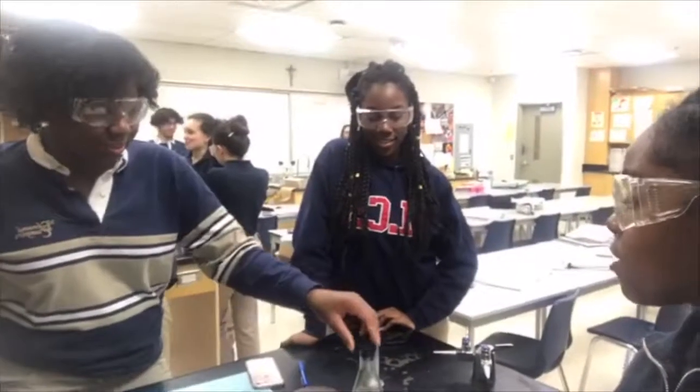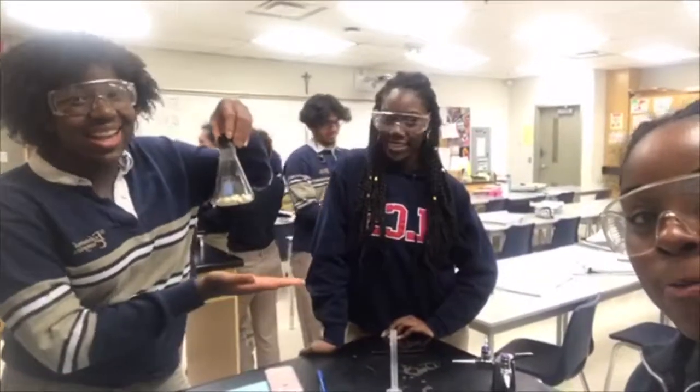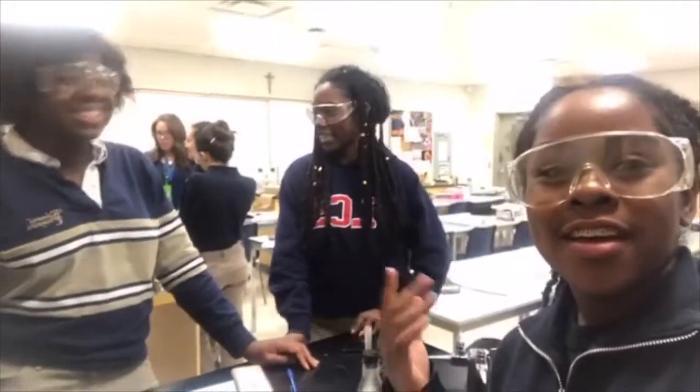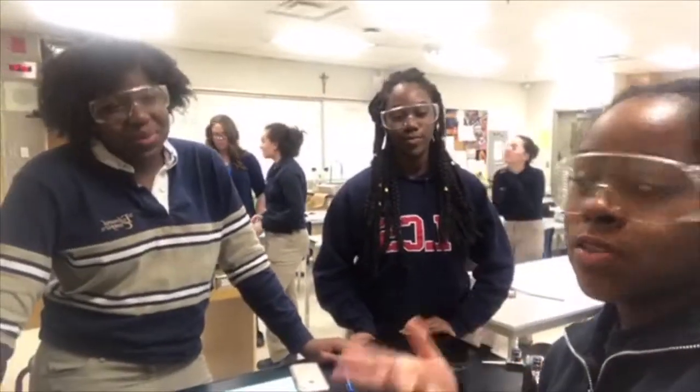See? This one, model it for everyone. That's okay. We popped popcorn. It's kind of hot, but it's okay. Why did we pop popcorn again? To do percent something. Yeah, percent something. We're trying to see essentially how much water is in the popcorn.